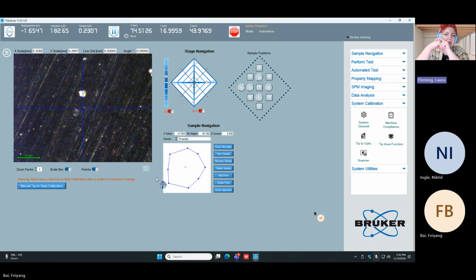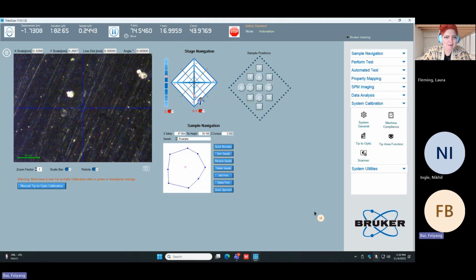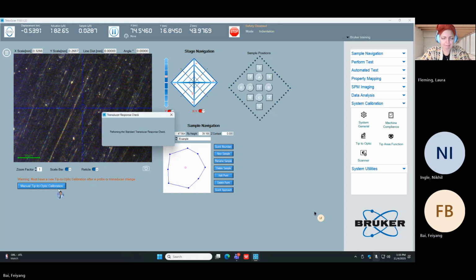I don't know how close we're going to be, but assuming it is close, I like to get away from big ugly spots like that one right above the reticle. So I would just drive south slightly, or in any direction. Yeah, that's a little bit better. Okay. Okay, next step. Good.